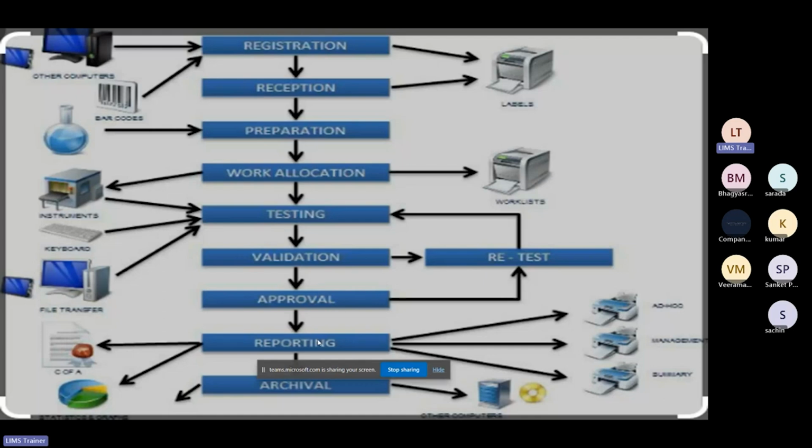So the archival part is very critical and very important. Otherwise, what will happen is data loss. If some data was recorded in an audit and is not available in the system, it will be a big question mark on whatever activity was done in that particular time period.